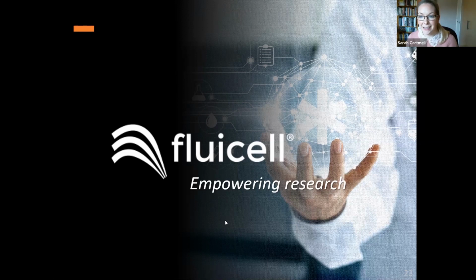Donovan says, does the print head have multiple extrusion channels? For example, in the model you showed, can the 3 different cell types plus the adhesion layers be printed in a single print? Yes. So typically the 3 channels that you see, one is outflow, 2 are inflow, but we load 4 different samples into the print heads. Generally, what we would do is save one as a washing solution just in case, but yeah, we absolutely can do 3 different cell types and a printing agent at the same time.